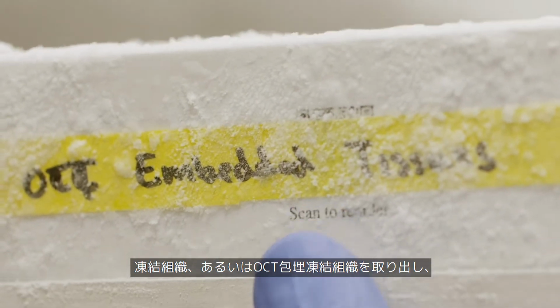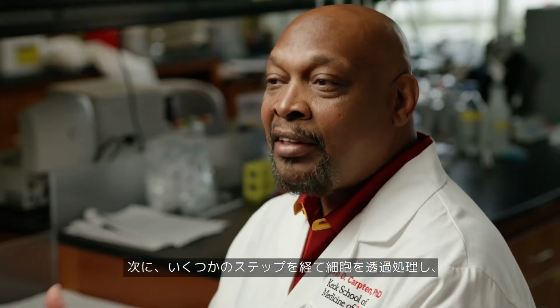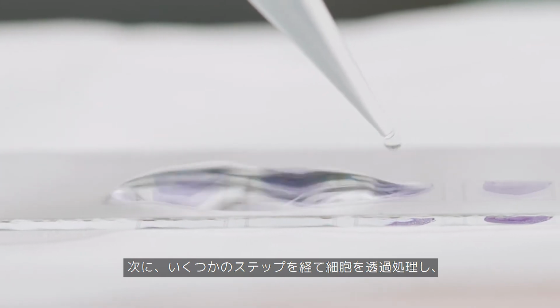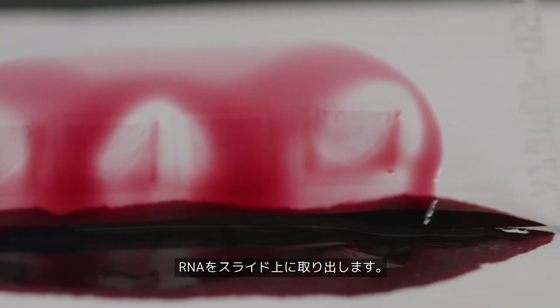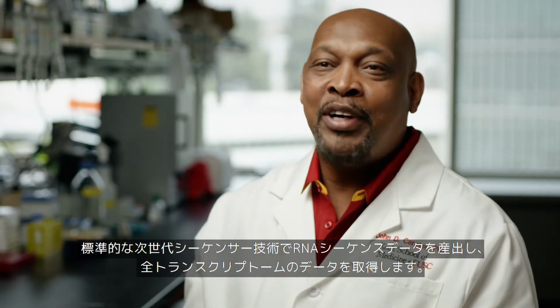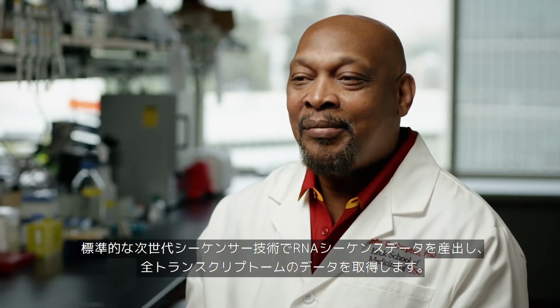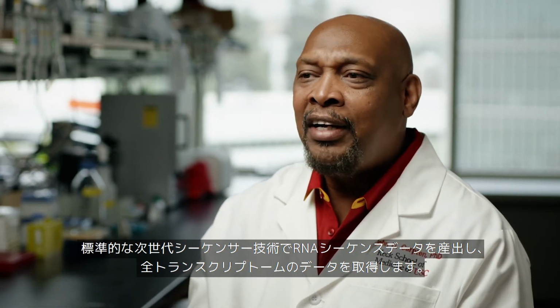Right, slides and tissue. So you take your tissue, your OCT embedded frozen tissue, you slice it and you place it on the slide, right? Of course, then once that's done, there's a series of experiments that have to be performed to permeabilize the cells and release the RNA onto the slides. And then at that standpoint, it's generating the RNA sequencing libraries and then utilizing standard next generation sequencing techniques to generate RNA sequencing data or whole transcriptome sequencing data. So it's a really efficient process. And so we're really excited that we don't have to buy a machine in order to use the technology. All we have to do is buy the slides.